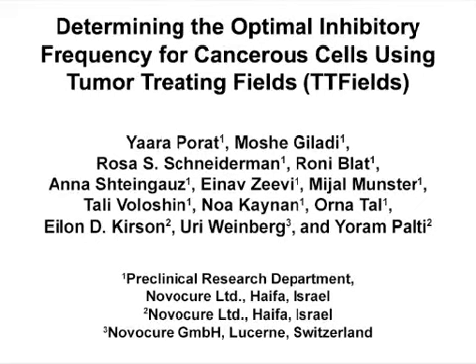The overall goal of the TTFields in vitro application system is to investigate their effect on cancer cells from different tumor types, to guide TTFields clinical administration and optimize treatment outcome. This method can help define the effect of different TTField parameters on cancer cells.